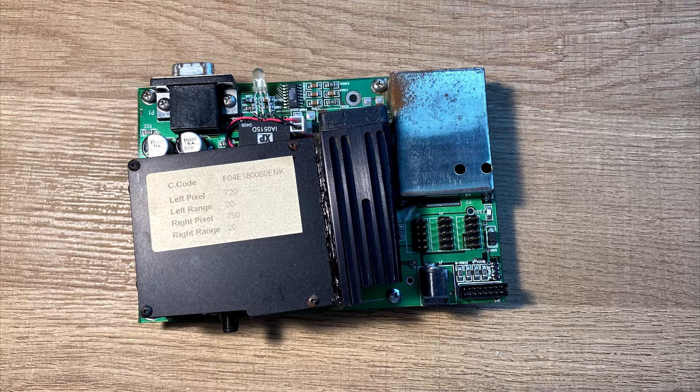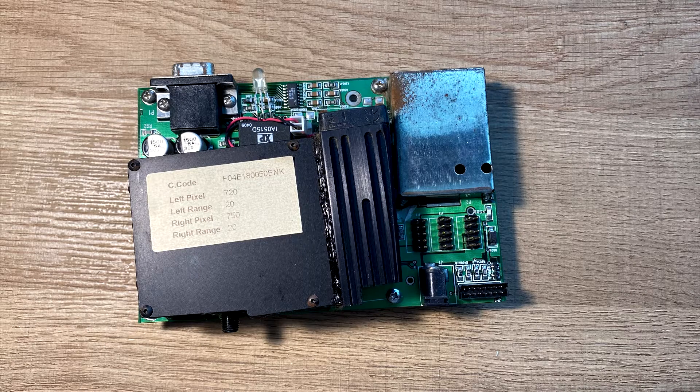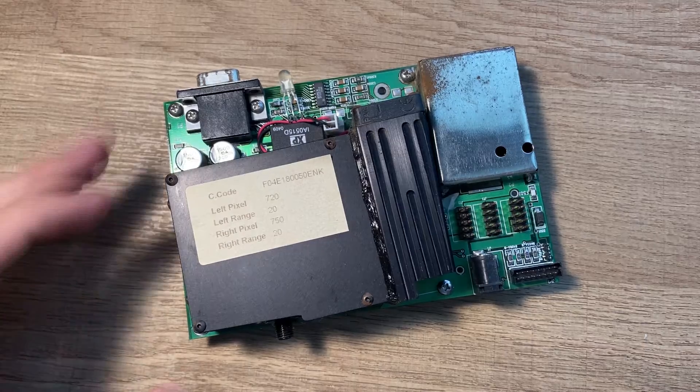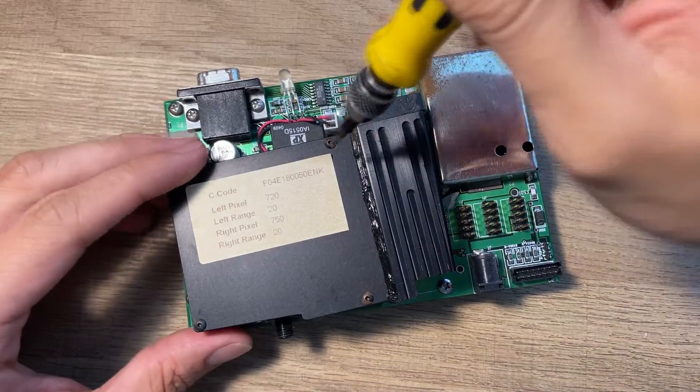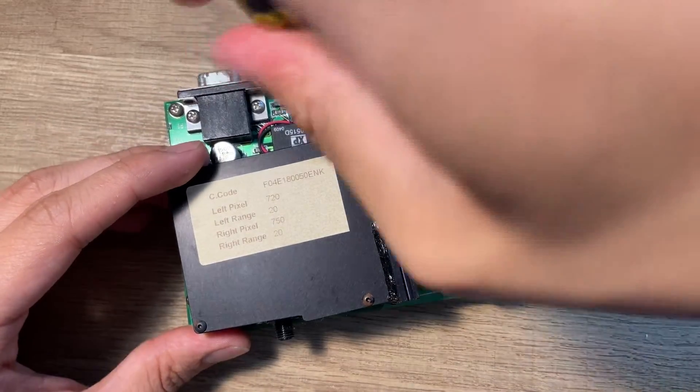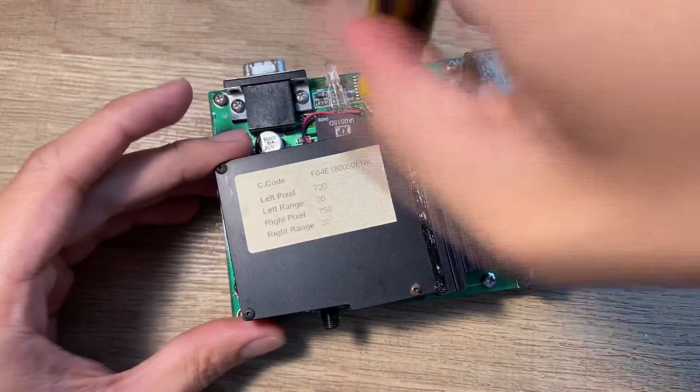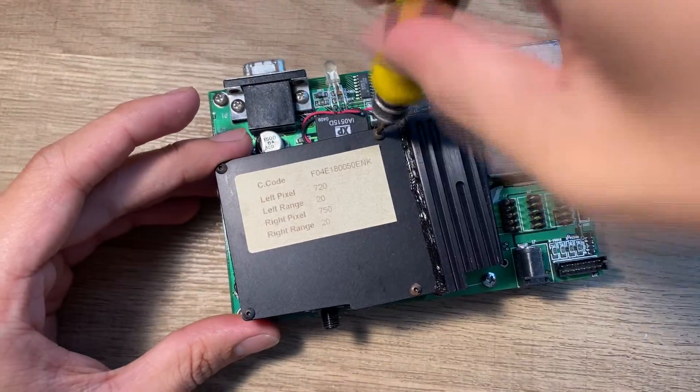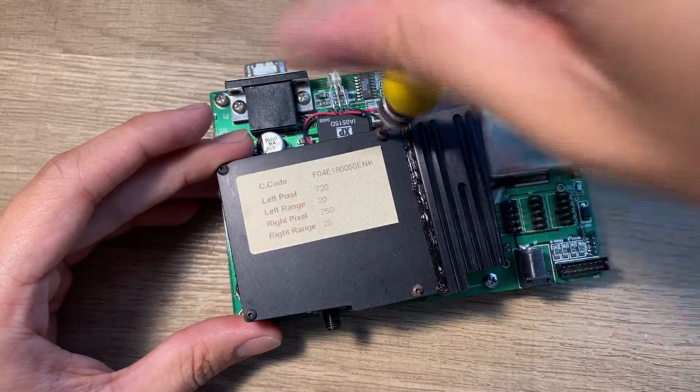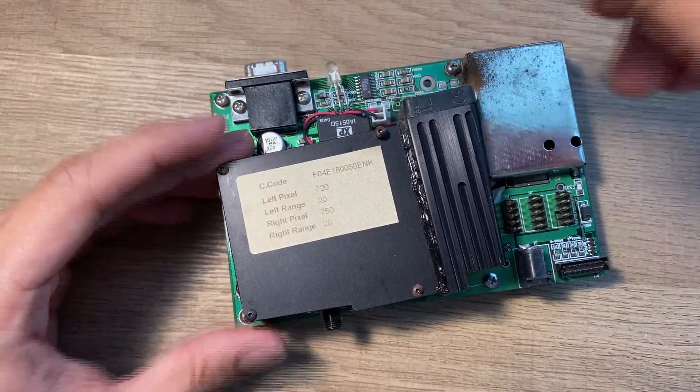I then determined there will be an issue with the optical bench, so I removed the spectrometer module and opened it up. The optical bench is installed inside the black box, which is enclosed by four hex bolts.